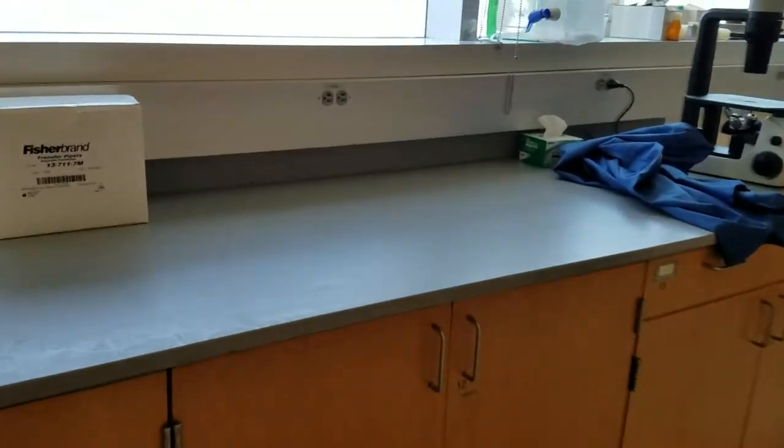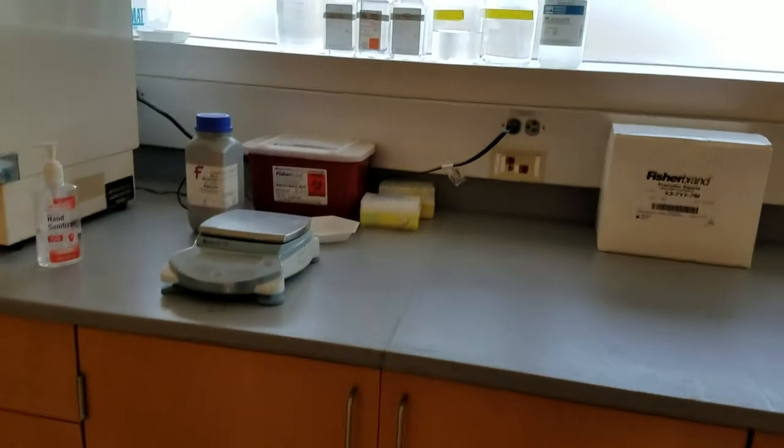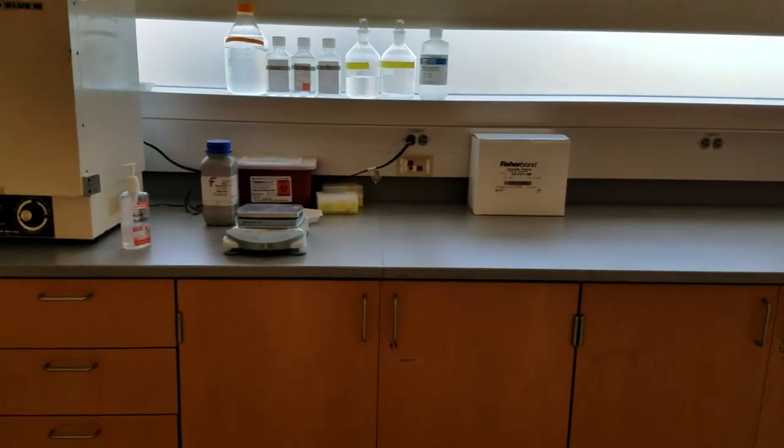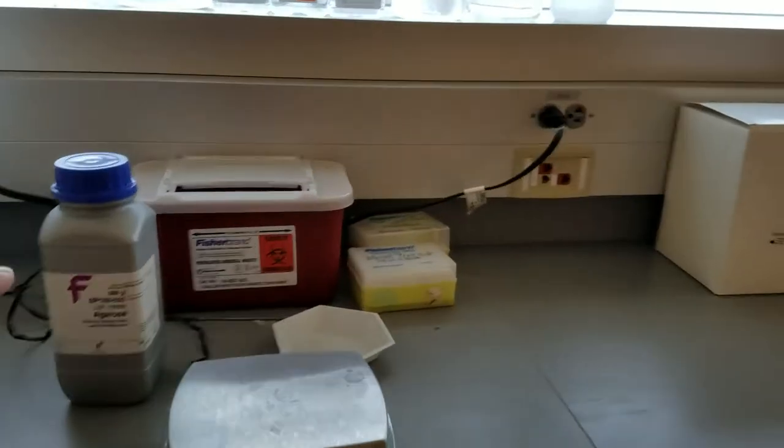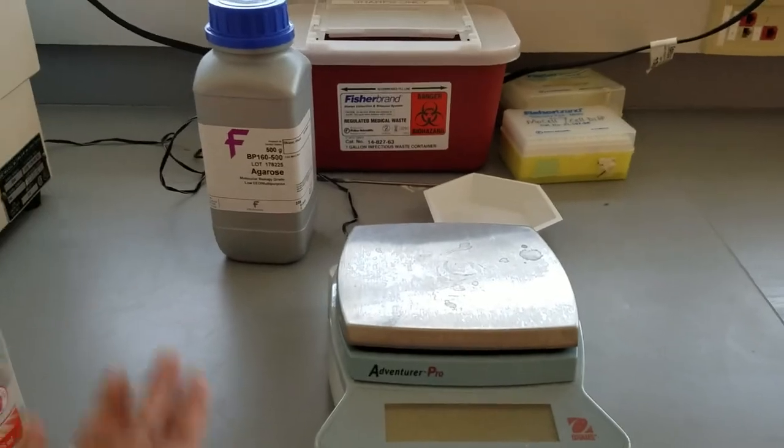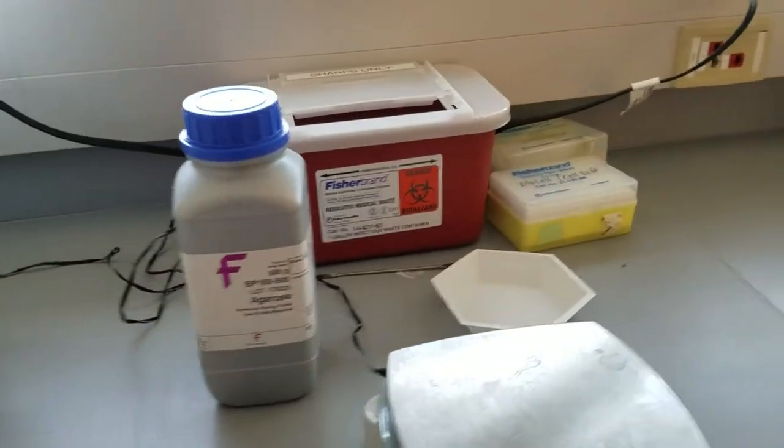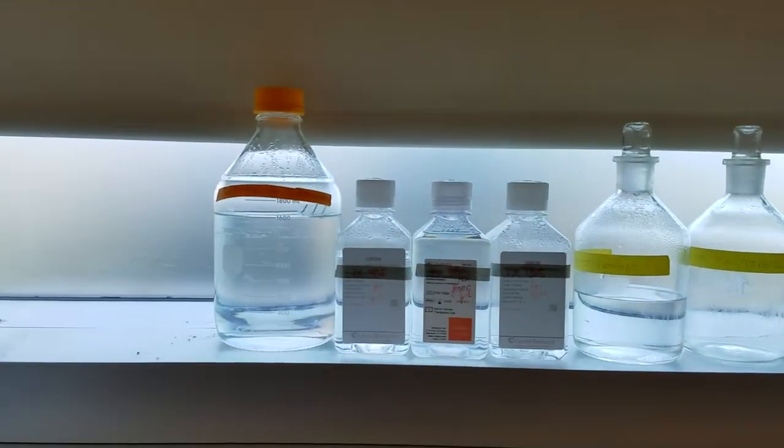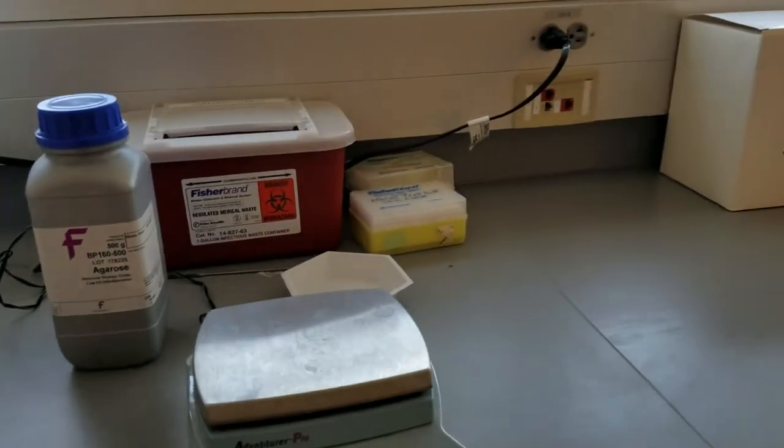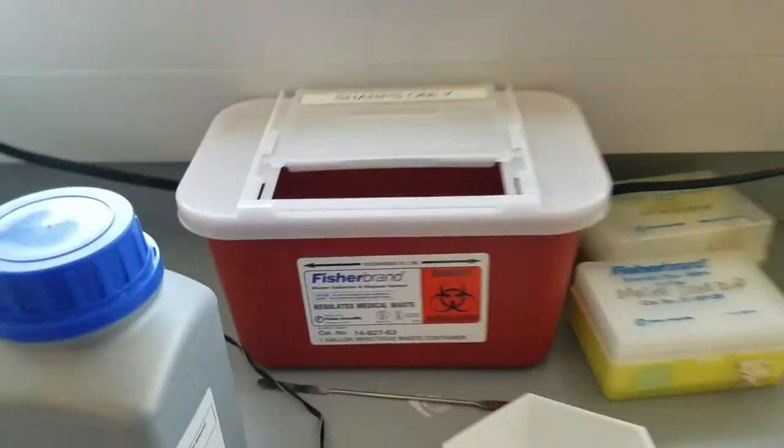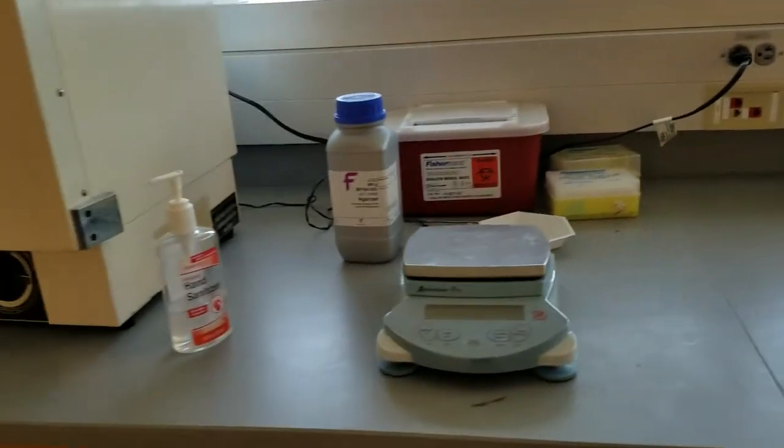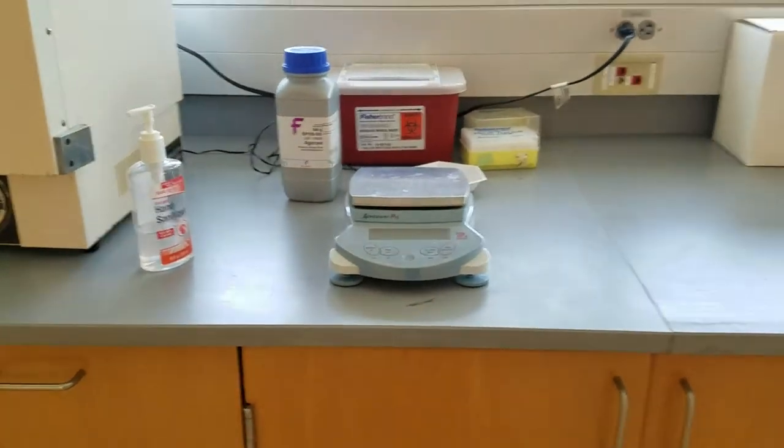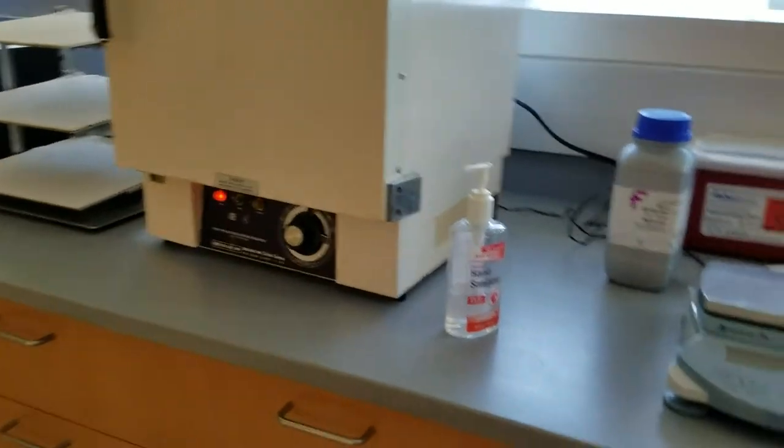When we are running gel electrophoresis to look at our nucleic acids or proteins, we run them on this back bench area. We have our weighing boats and our balance to weigh out our different materials - the agarose for example or any other powder we need to weigh out to make our gels. We have the buffers that we need to run electrophoresis as well, and then we have a sharps only container to collect any sharps like the pipette tips or the glass cover slips or anything like that that we need to go to waste. We always have hand sanitizer all over the place.